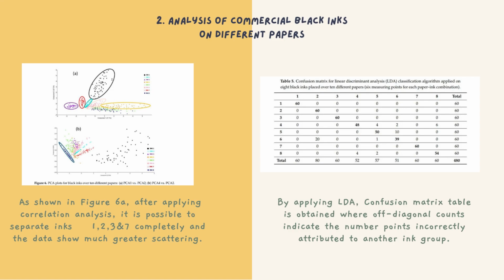PCA analysis is applied for the dataset containing a total of 480 data points, where 6 measurements were taken for each sample.